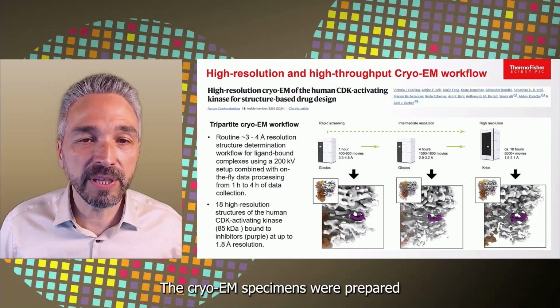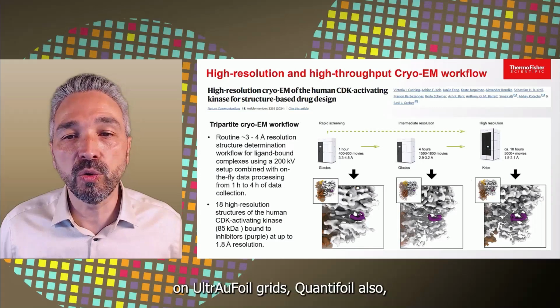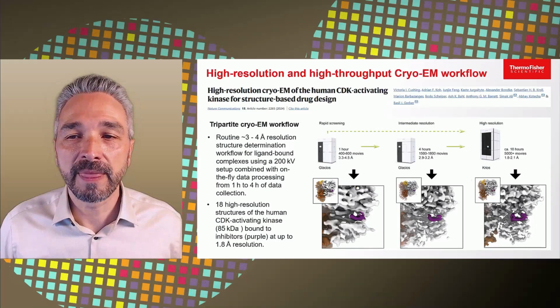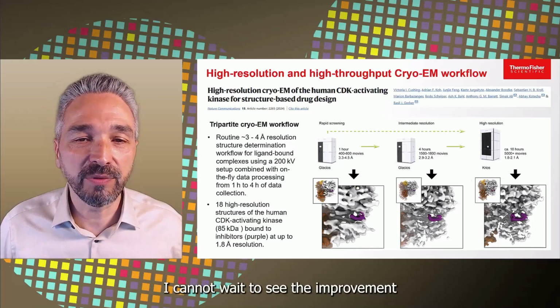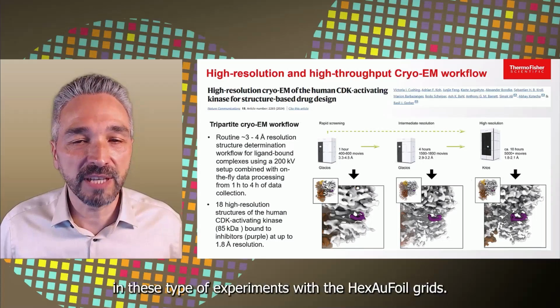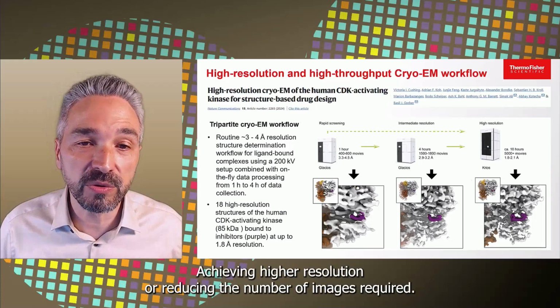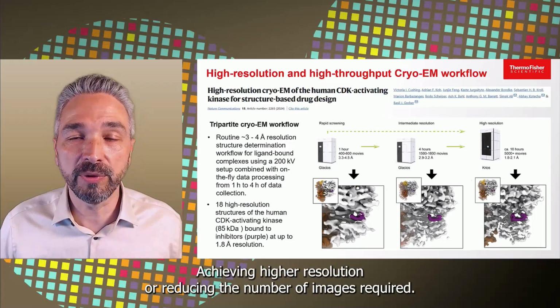The CryoEM specimens were prepared on HexAuFoil grids, QuantiFoil also. I can't wait to see further improvement in this type of experiment, with the HexAuFoil grids achieving higher resolution or reducing the number of images required.